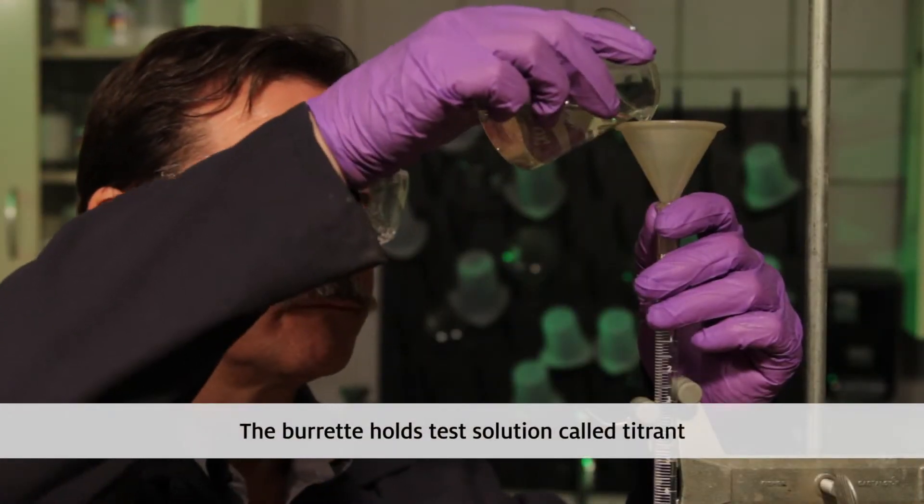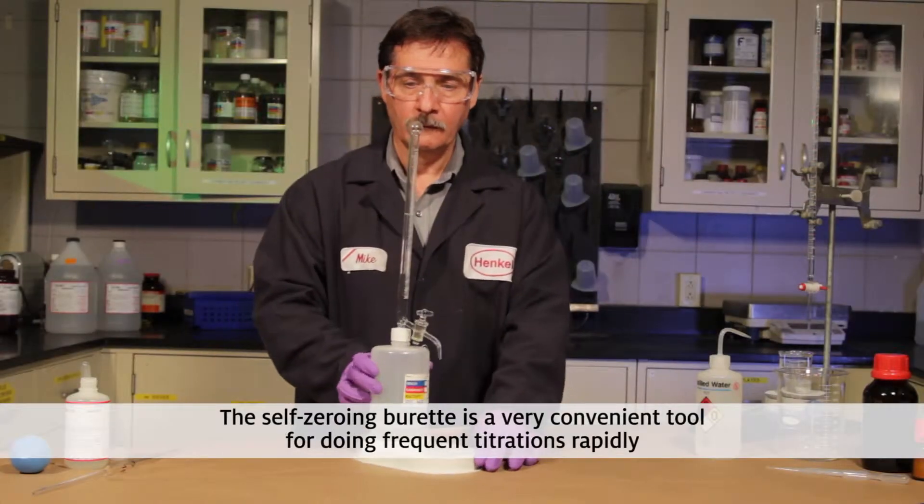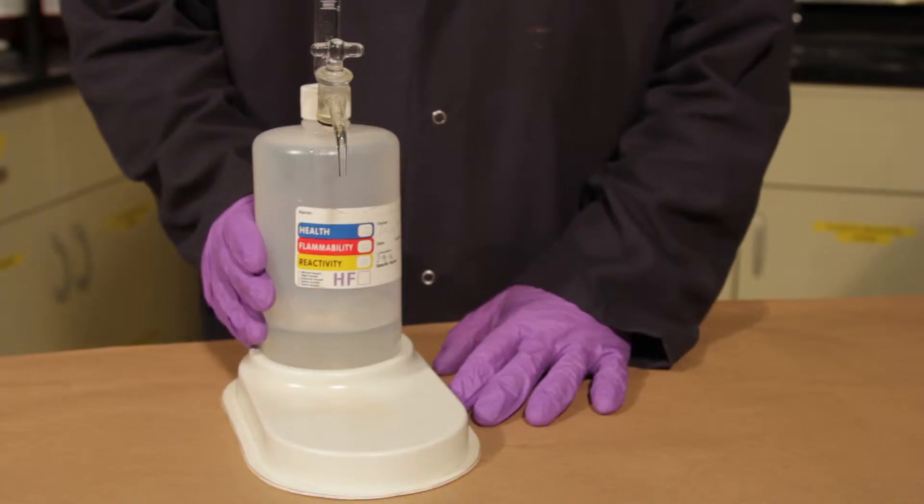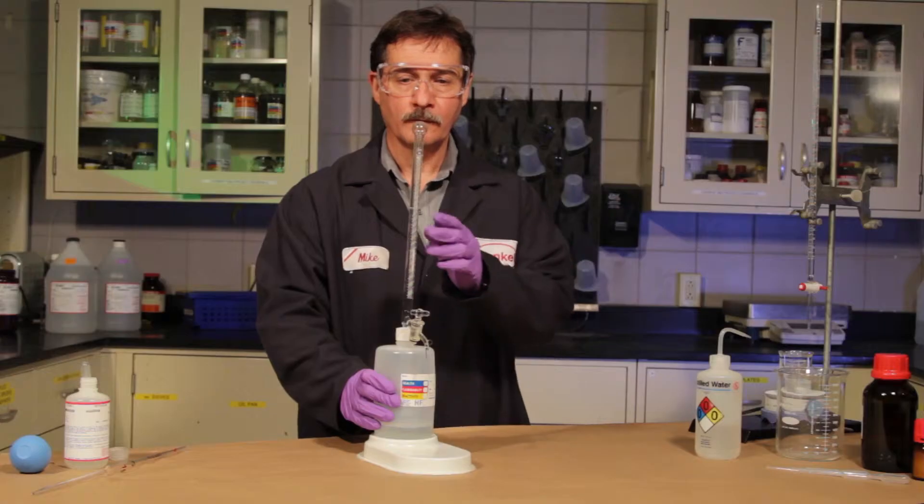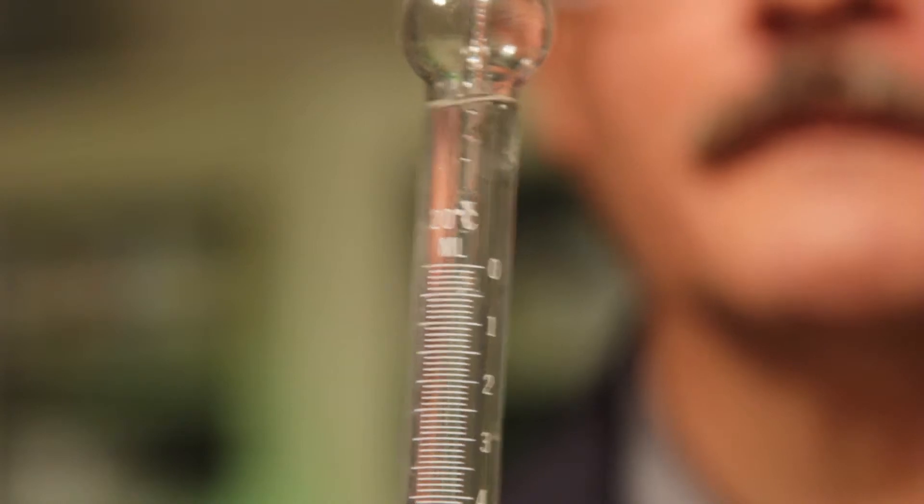The burette holds test solution, sometimes called titrant. The self-zeroing burette is a very convenient tool for doing frequent titrations rapidly. The burette sits on a reservoir of titrant and with a quick squeeze and release, it fills the burette and automatically sets the solution level to the zero or starting point.